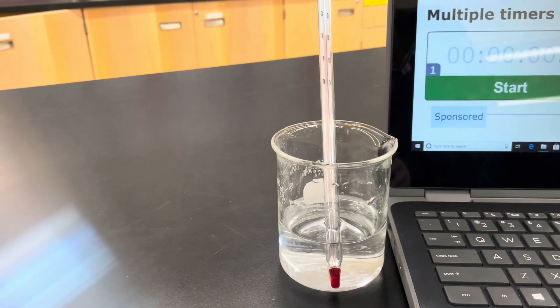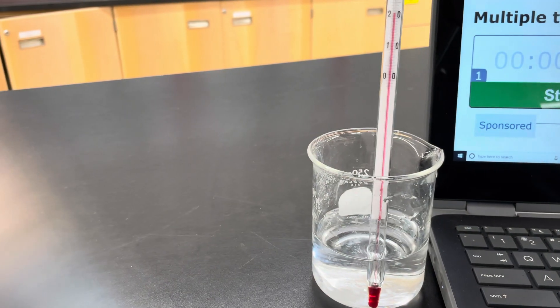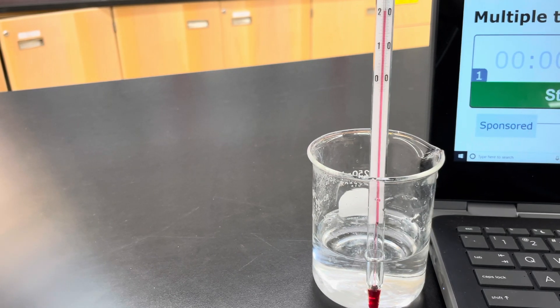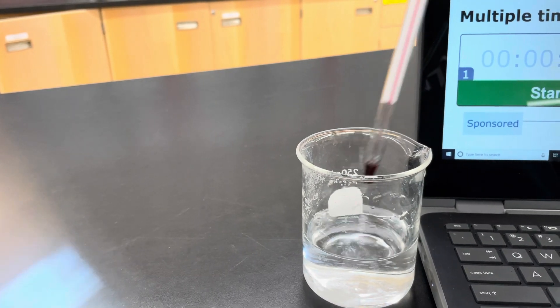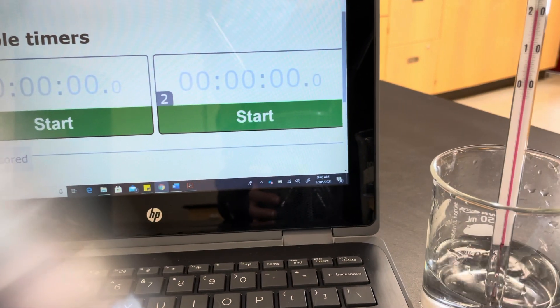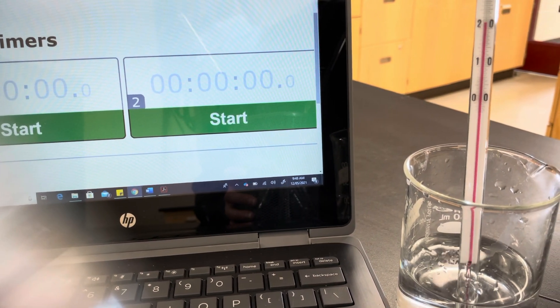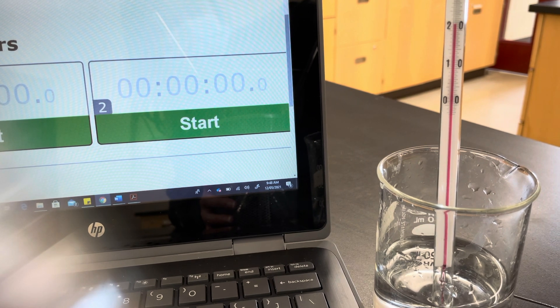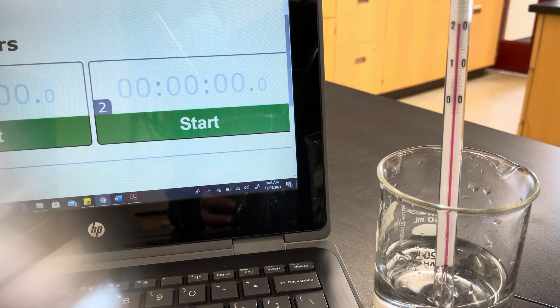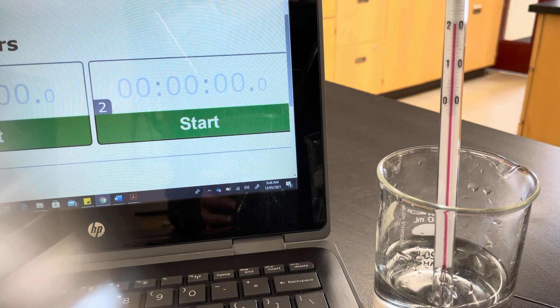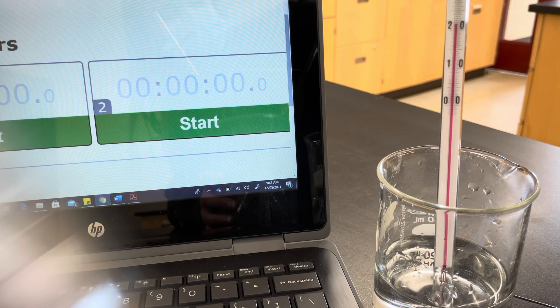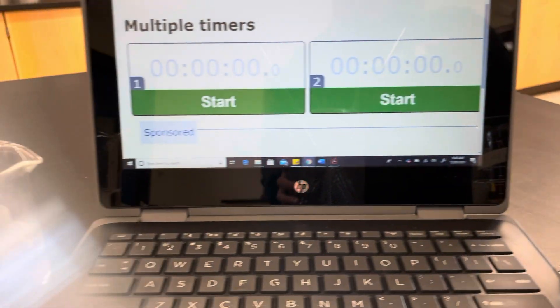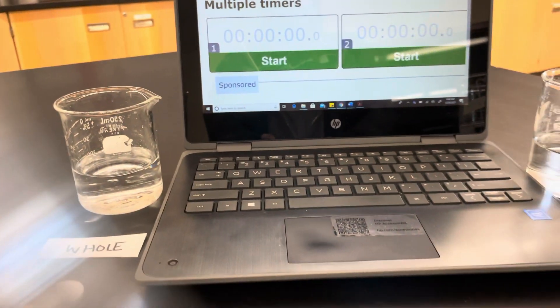The first thing we're going to do is check the temperature of our water. It looks like our temperature is 22 degrees for the whole one, and we'll check to make sure it's the same for the crushed one — just to make sure those factors are at least the same. So we're only changing the surface area of the tablet. That one also is 22 degrees.